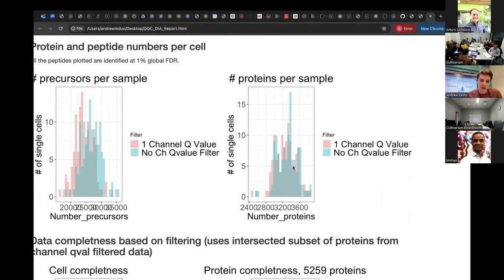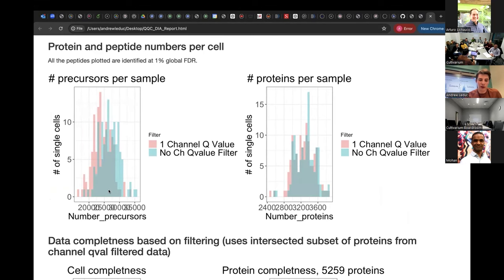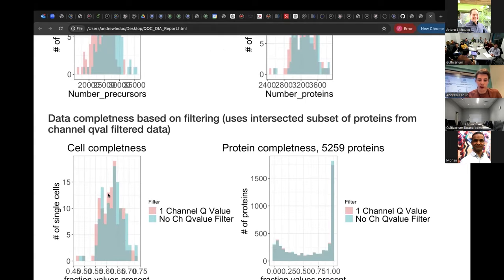There's a bit of difference in these distributions because I think some get NAs, because it had a hard time computing, which is probably close to a one. But if you set something like 0.05, you would obviously see this red distribution. It would say 0.05 channel Q value, and it would be somewhere over here, because it would filter out more stuff. Same with the precursors, and this is totally illegible, sorry.